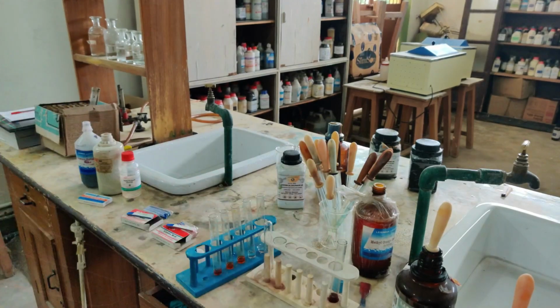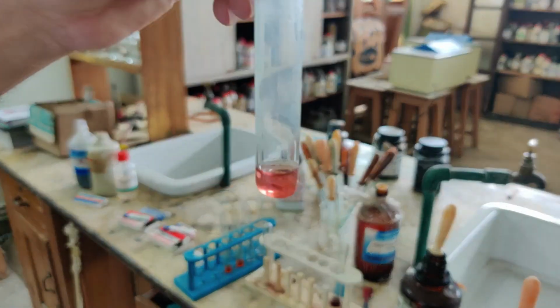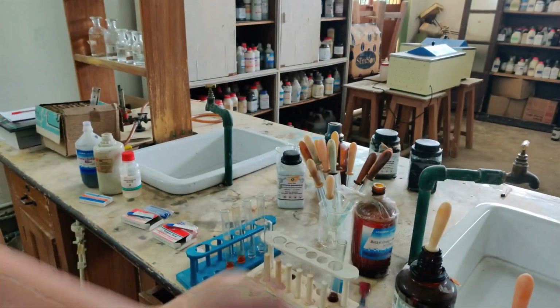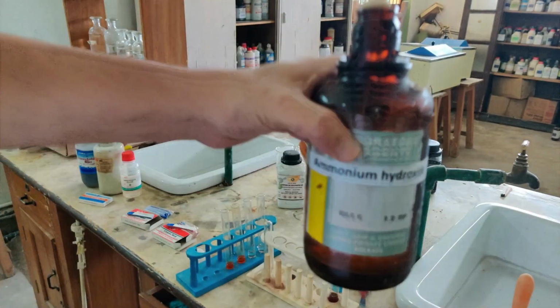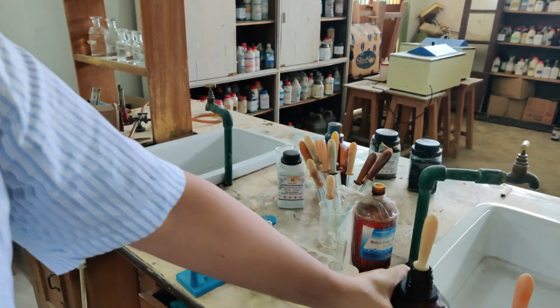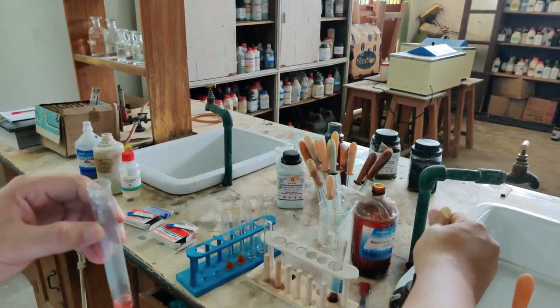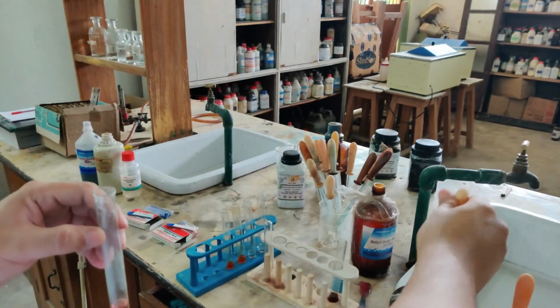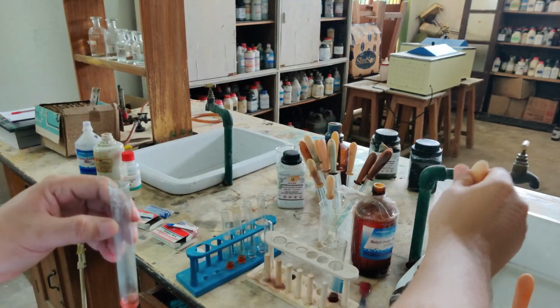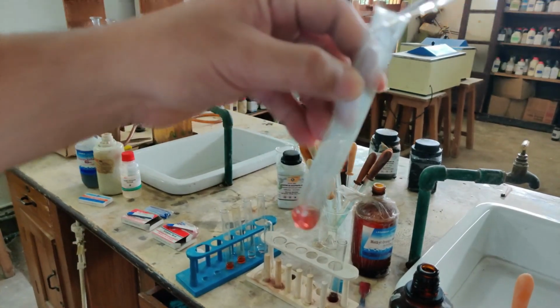Now I am going on to the next. Here is the red litmus. I want to test this red litmus with a base. Here it is, I am taking this base, ammonium hydroxide. With the dropper, let me add ammonium hydroxide and let's see what happens. Now see the color change that will be noticed there.